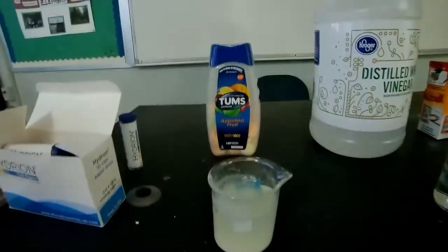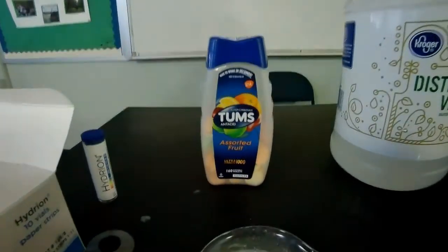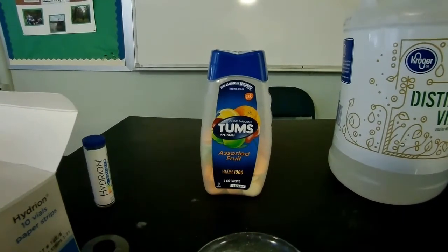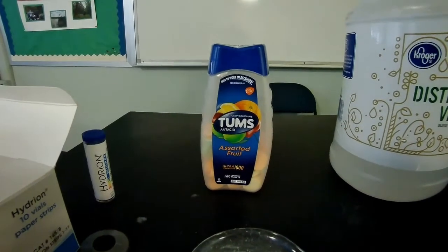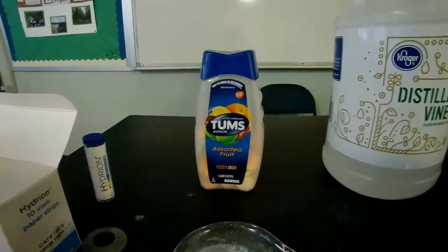This is Tums. And Tums on the bottle says it's an antacid. And if you've never taken Tums before, you take Tums when you have an upset stomach or maybe some stomach burn or heartburn kind of situation. So what do we think? Could that be an acid or a base?